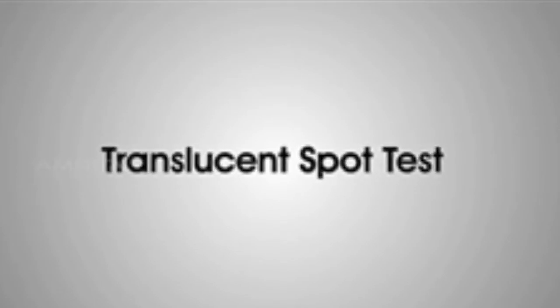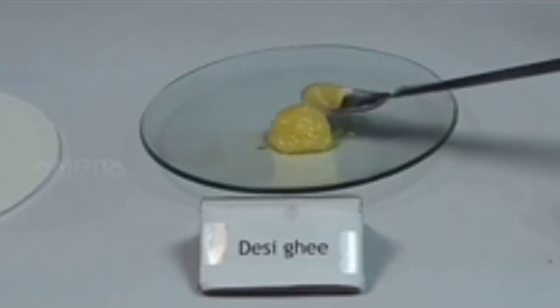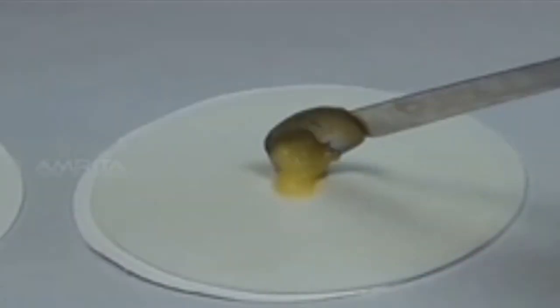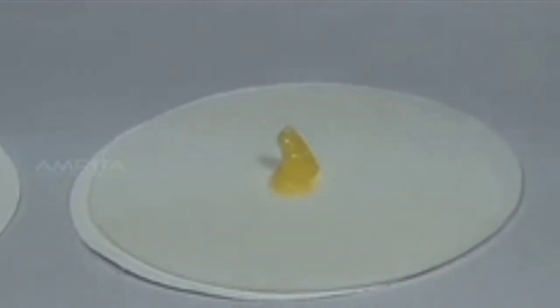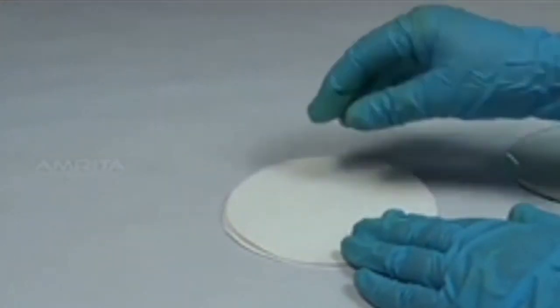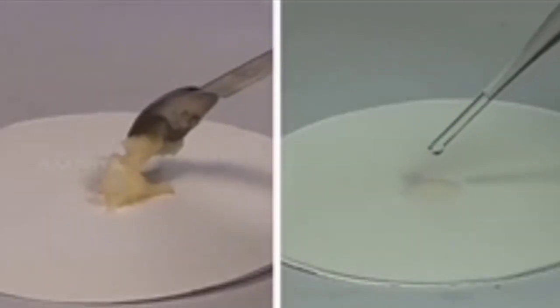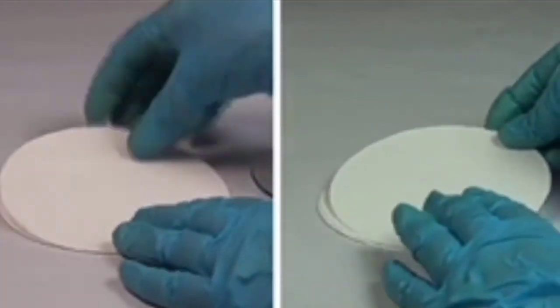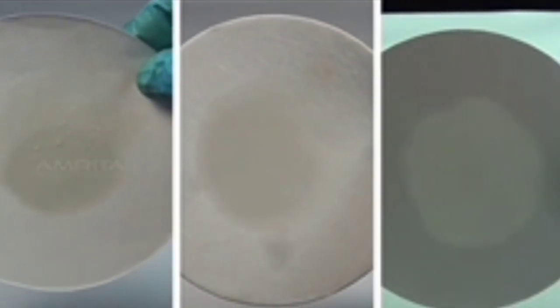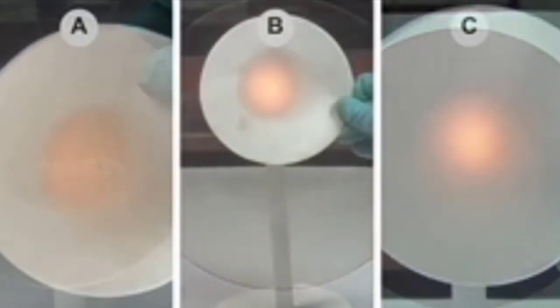Translucent spot test. Take a small quantity of desi ghee using a spatula. Transfer it onto a filter paper. Then press the substance with another filter paper. Repeat the experiment with vegetable ghee and refined oil. We can see that a translucent spot is formed on the filter papers.